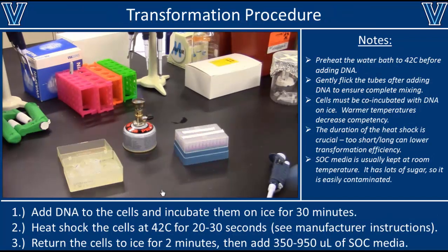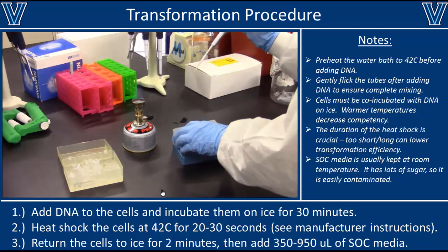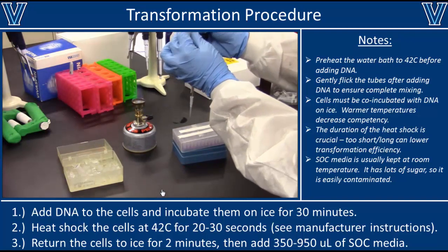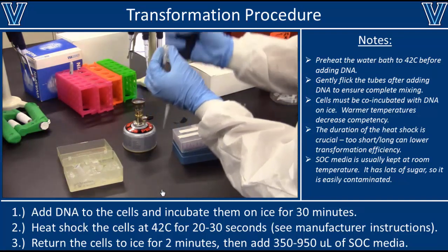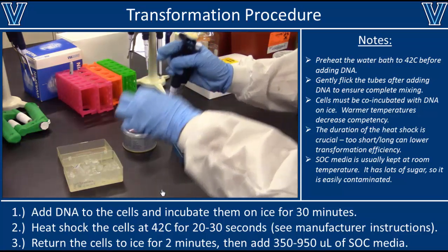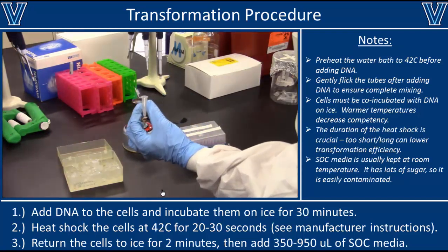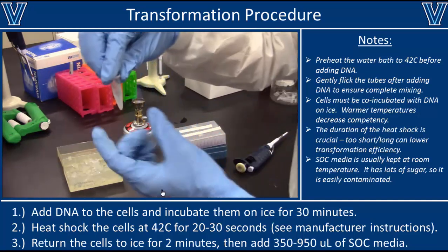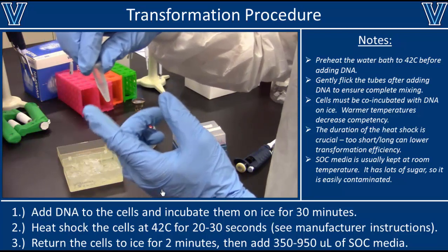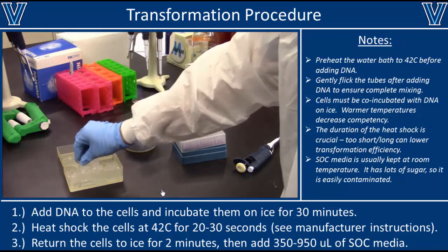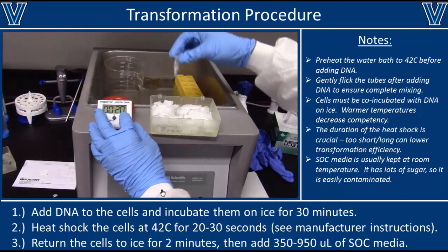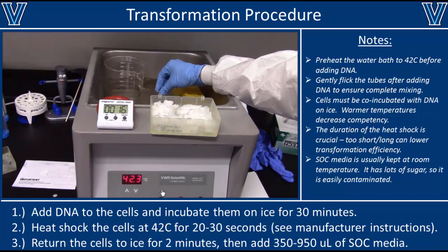In this video we're going to transform one aliquot of cells with a freshly ligated plasmid. When using a ligation reaction, add 5 microliters of the ligation mix to 50 microliters of cells. However, if transforming with an intact plasmid, use only 10 to 50 nanograms of DNA — you don't want to add too much DNA or the cells will overgrow the plate and become unusable. Once you've added the DNA, incubate on ice for 30 minutes, then heat shock at 42 degrees Celsius for 20 seconds. Some strains require a heat shock of 30 seconds — check the manufacturer's instructions for the correct time and temperature.